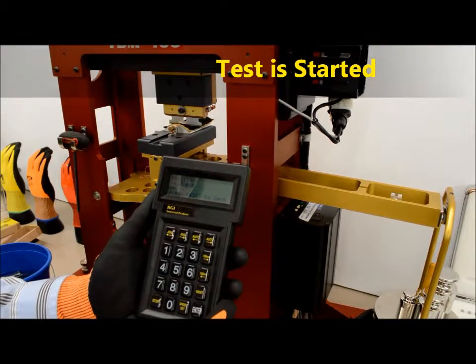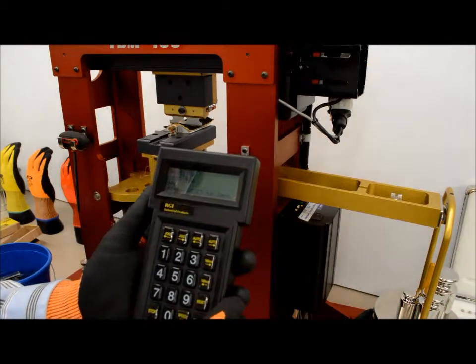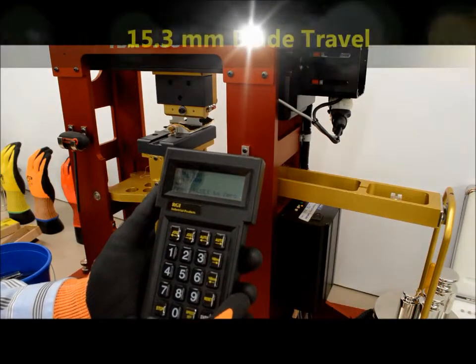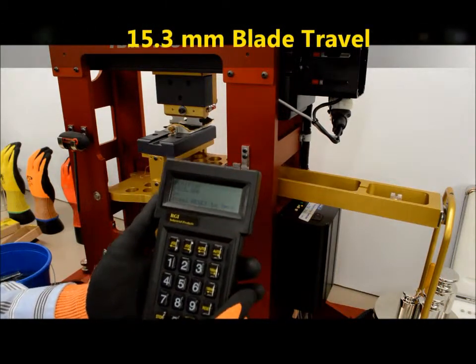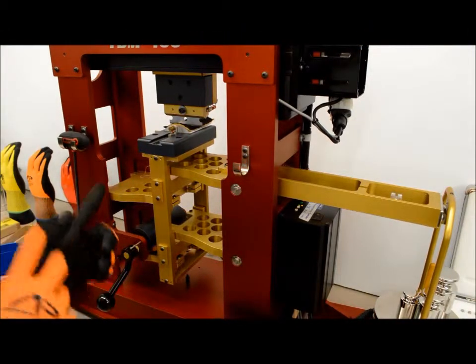We're measuring the millimeters until it's cut through, which ends up being 15.3 millimeters. That's the blade travel until the razor blade has cut through the glove material, made contact with the copper strip, and is shorted out.